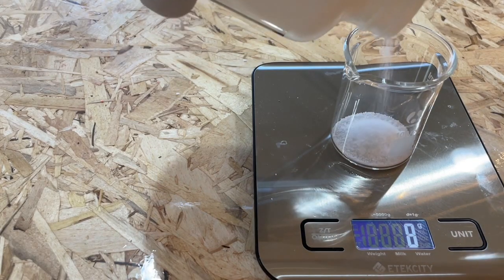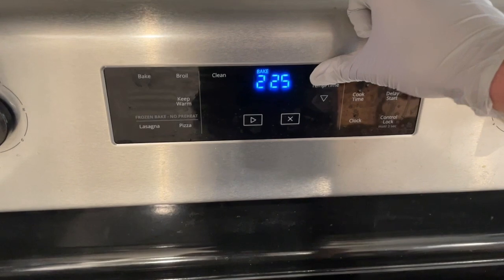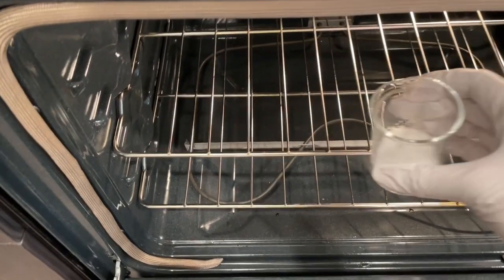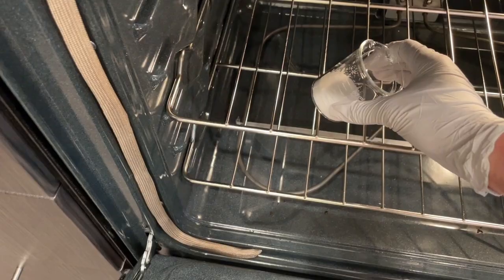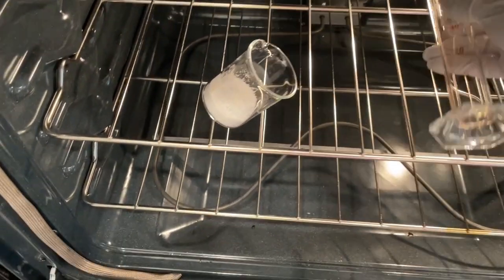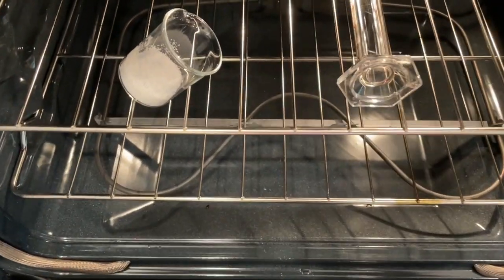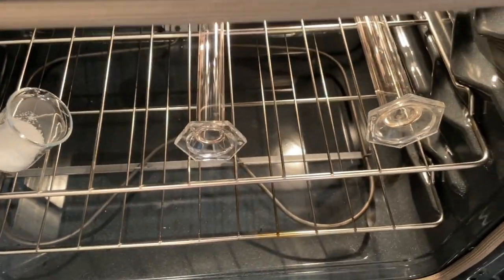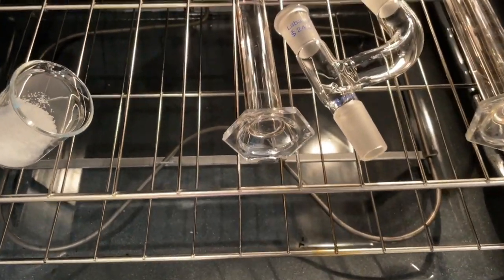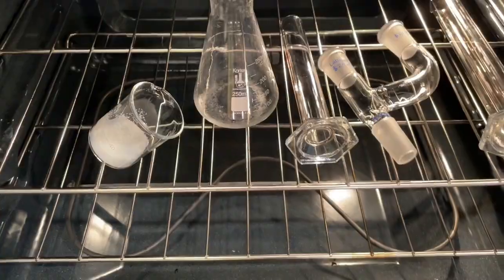To start the experiment, I first measured out a bit more sodium hydroxide than I would need, and I set an oven to 250 degrees Fahrenheit. I bake the sodium hydroxide and all the glassware I will be using in the oven for about half an hour to remove as much moisture as possible. This is because when the sodium forms, it will prefer to react with the water to become sodium hydroxide again, so baking everything gets rid of as much water as possible.